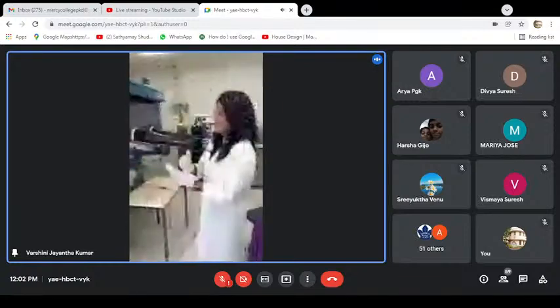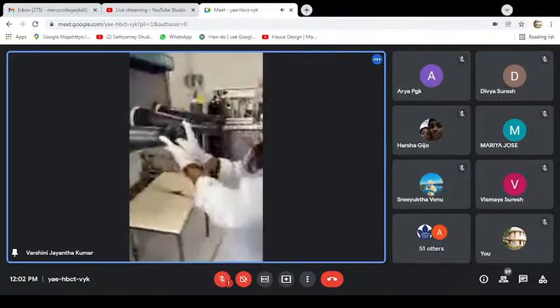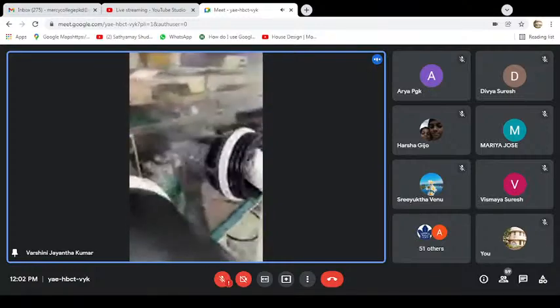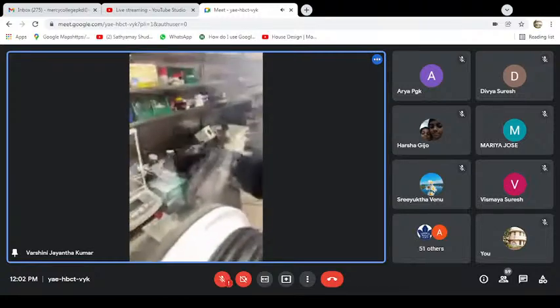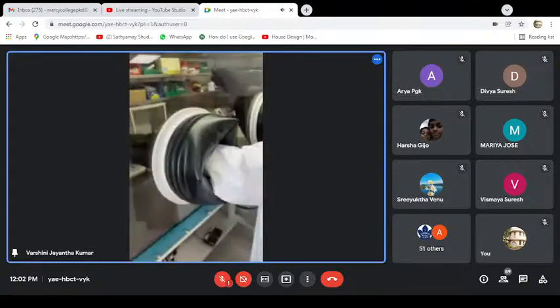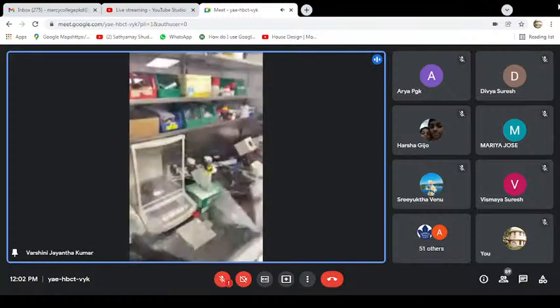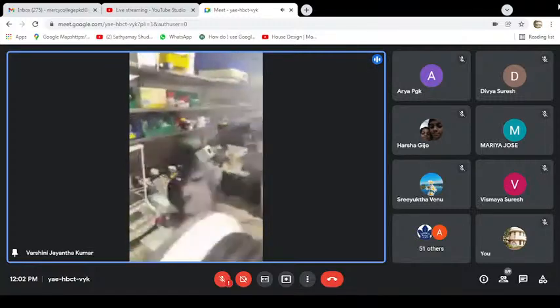To go inside the glove box, we have to wear cotton gloves like this, and then wear our lab coat, and then we have to insert the fingers like that, slowly and gently push it in, so that our hand is now inside. And now we'll do the other hand. So we can work inside the glove box, we can move stuff, we can store our compounds, and sometimes I even do cyclic voltammetry inside the glove box for my sensitive compounds. So this is how a glove box works.